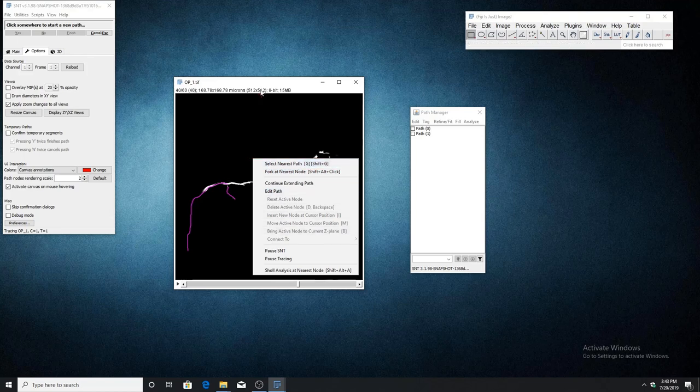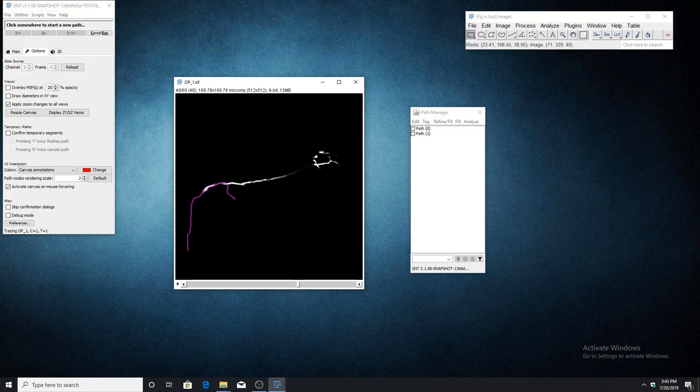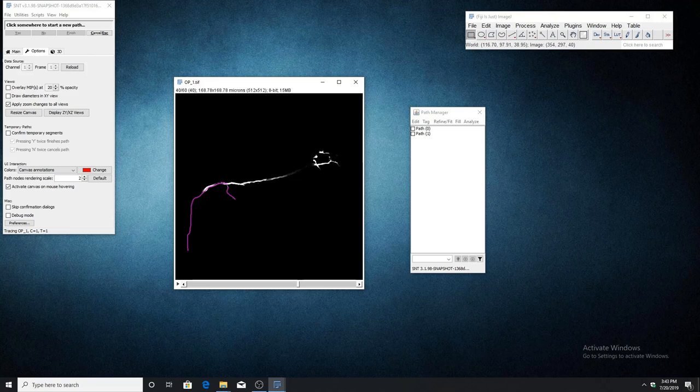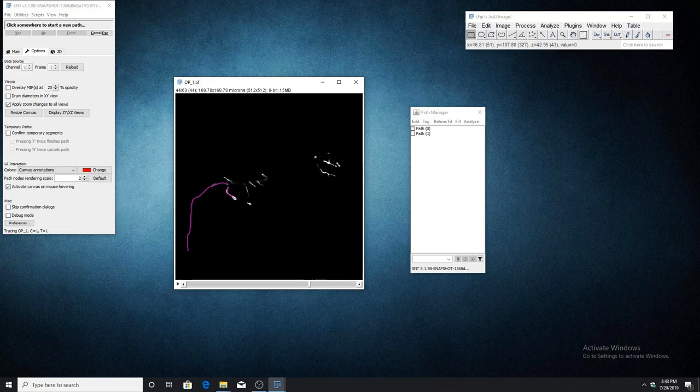You'll notice that I have two paths traced that are disconnected, and this can be seen in the path manager since one path is not a child of the other. The primary path actually stops abruptly in the middle of the axon.